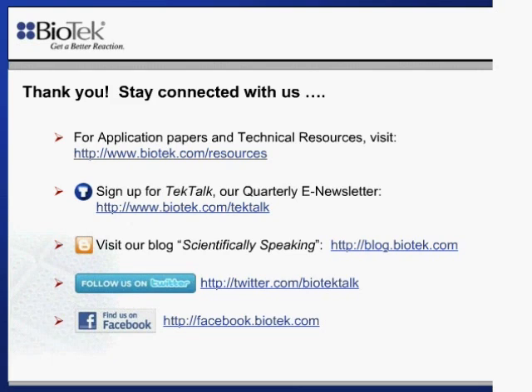Next question is, can you please say more about the path length correction procedure? It seems to be based on DI water and then used for other samples of the same volumes. Is that correct? That's not entirely true. It is based on water. However, it works on any sample that is aqueous.